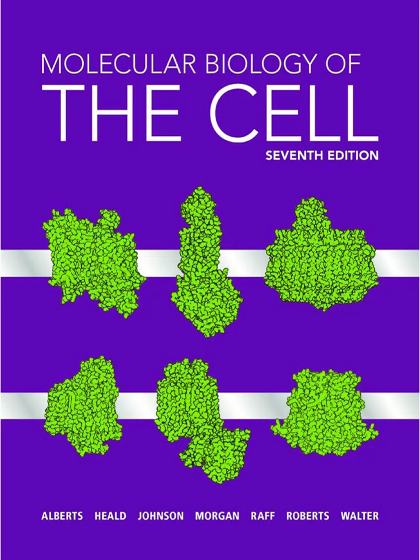Absolutely. And often, because these processes are slow, researchers use time-lapse microscopy. Take a picture every few minutes, then play it back fast. Like a biological fast-forward, revealing things that happen over hours or days. Yeah, it brings those slow, dynamic processes to life.